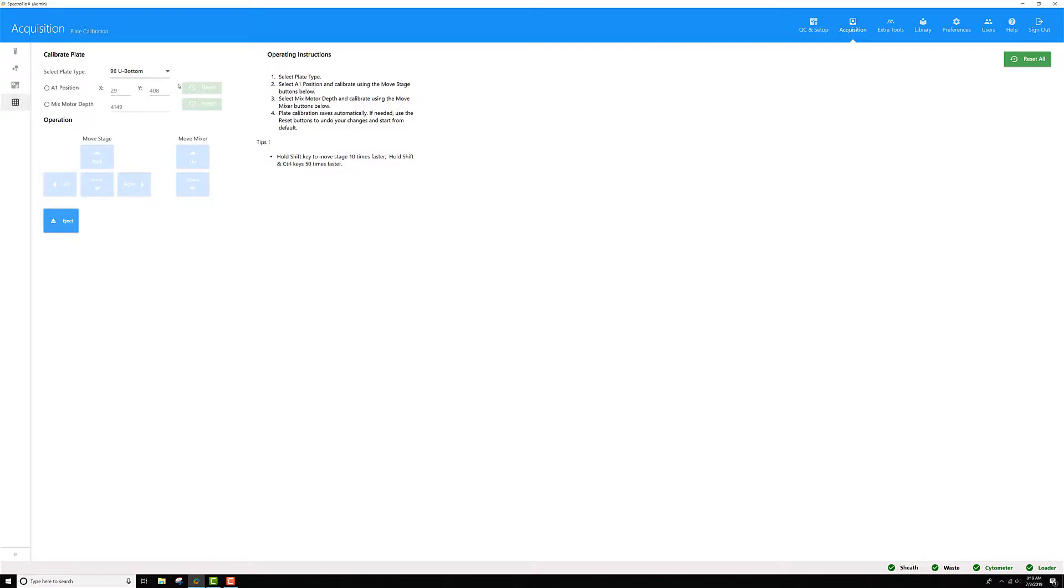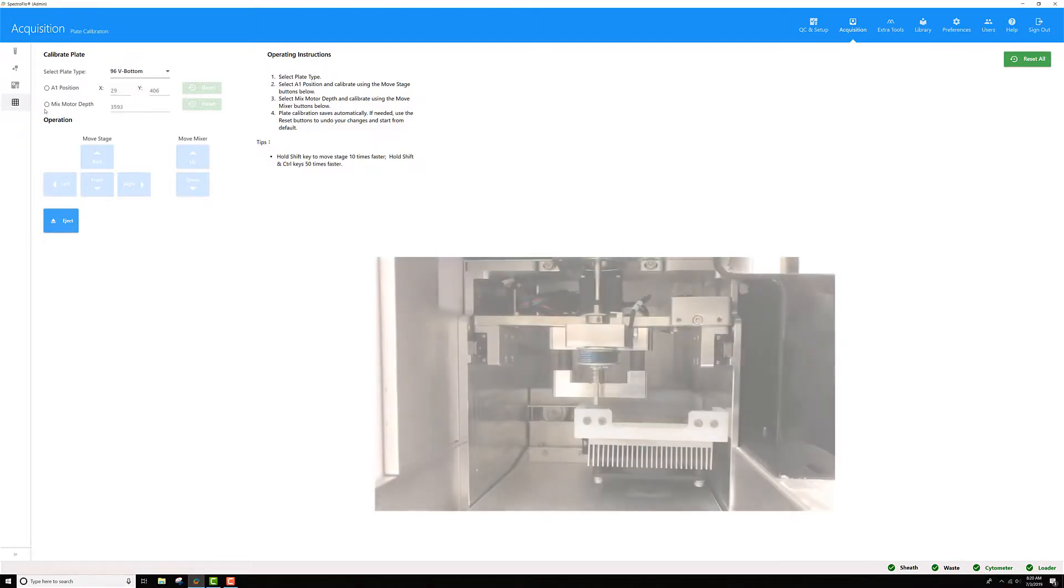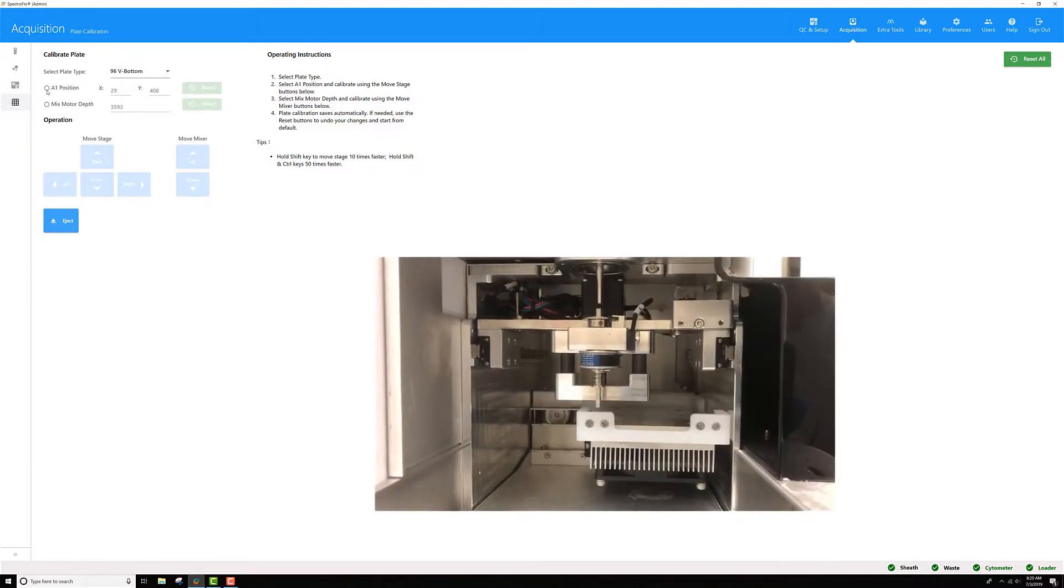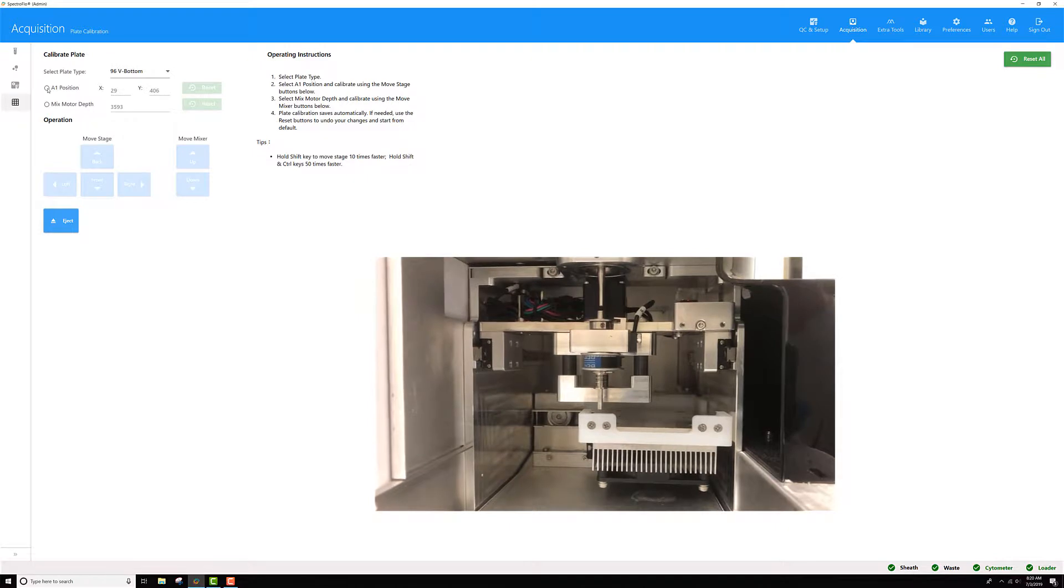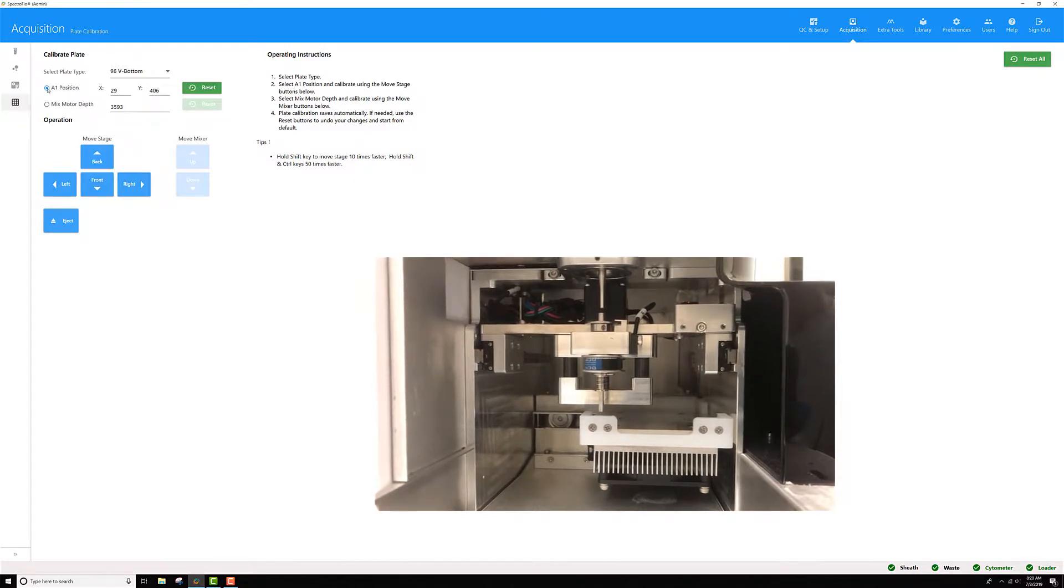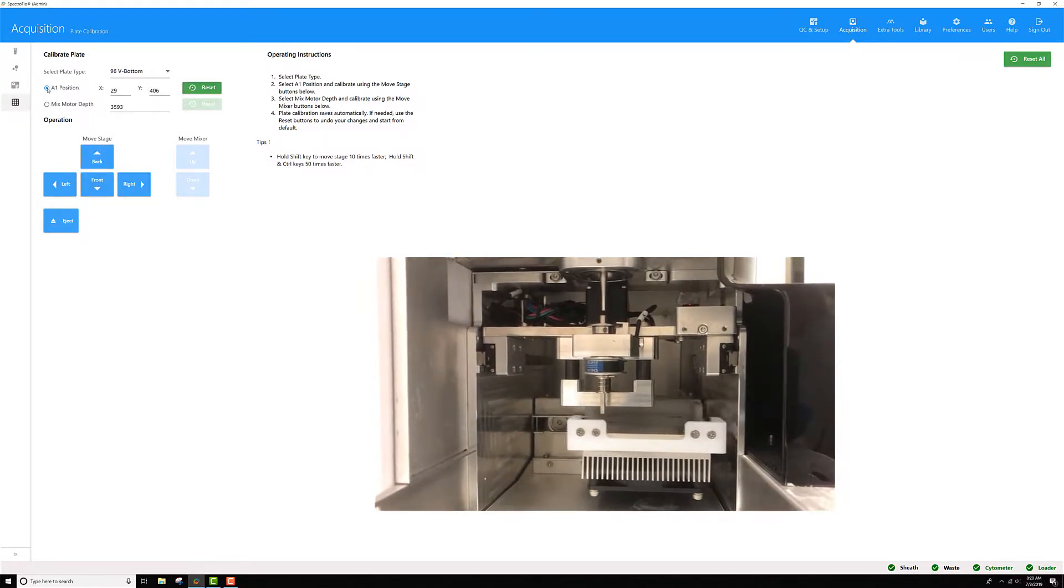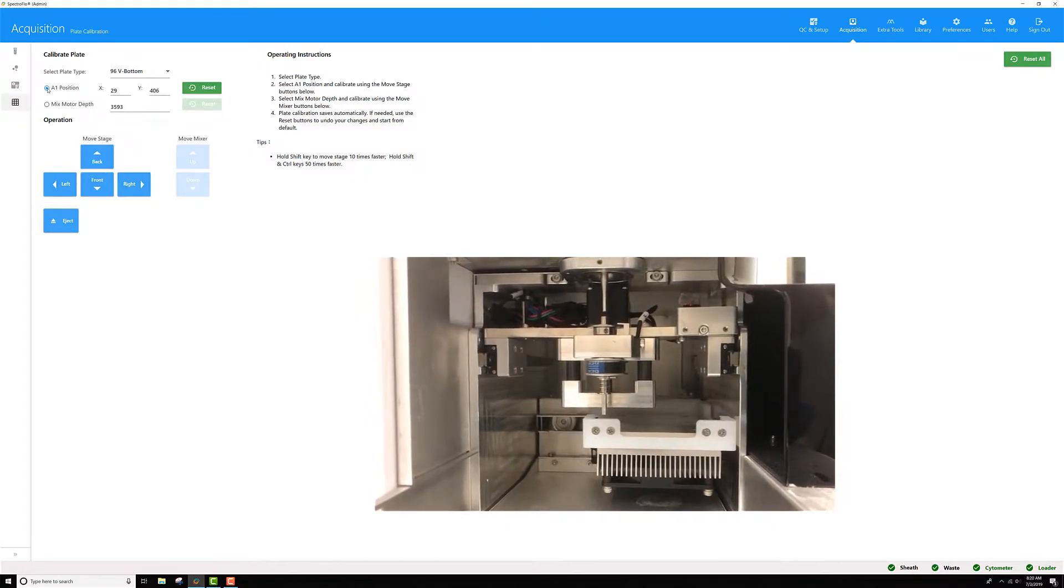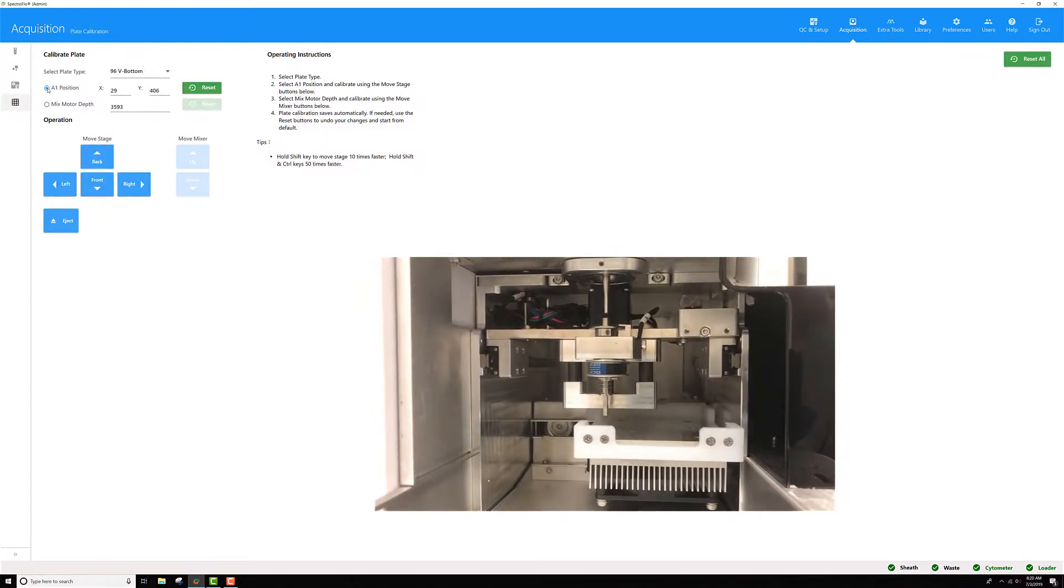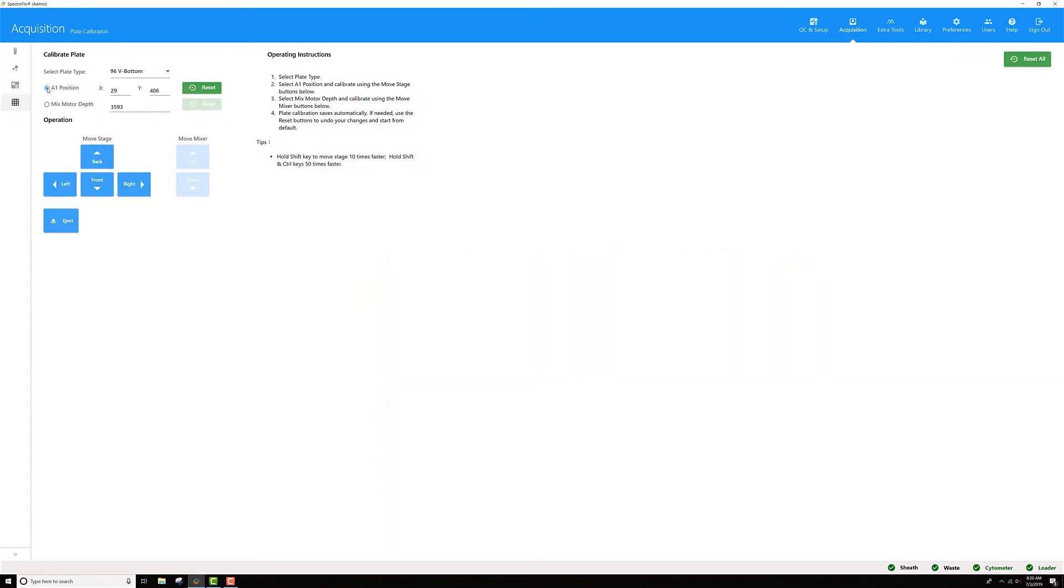Select the plate type that you want to adjust the calibrations for. Today I'm going to try a new V-bottom plate. Then, select this A1 radio button. Wait for the loader to home.